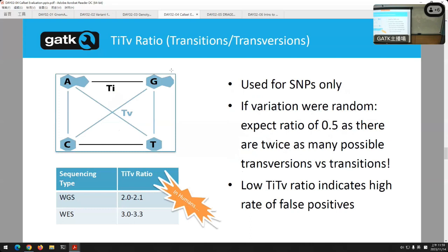So you can calculate that ratio in your call set, and you can say, does my call set match what I expect to see in nature? Or does my call set look like I'm seeing a lot of noise? It's one of those cool metrics where, as has been a theme in many cases, we pull in additional information to better give us context to interpret what we're seeing. And important, again, in humans, it differs slightly. We mentioned grabbing the right truth set, right? It differs between looking at the whole genome versus just exomes. You see slightly different numbers there.